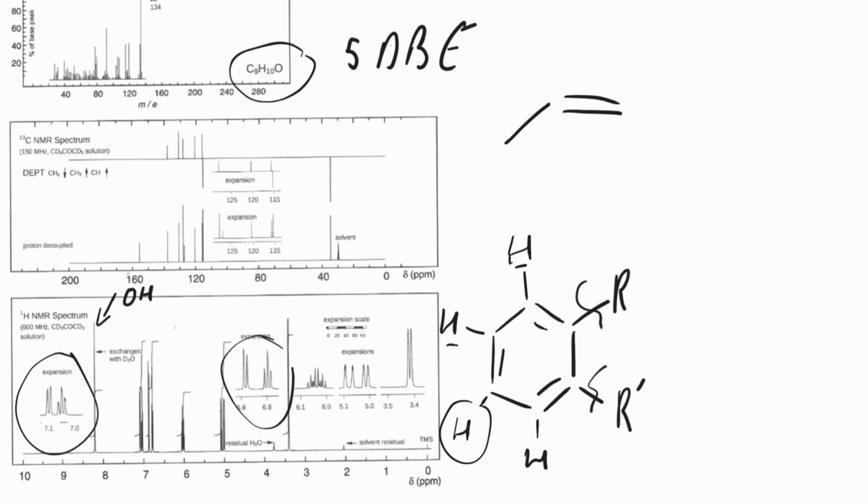For this spectrum, we would see peaks pointing up if it is a CH or a CH3, and peaks pointing down if it is a CH2. We see 2 peaks that point down, so there are 2 carbons that have CH2 on them. If we were to attach our propene to our ring through this carbon here, then we would have a CH3, we'd have 1 and 1. This doesn't agree with what we just said we saw in the DEPT.